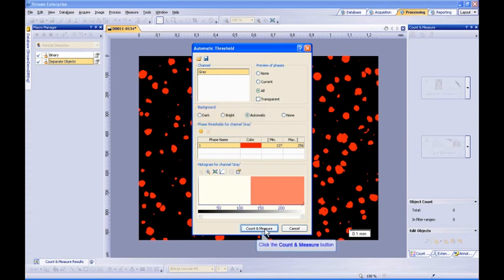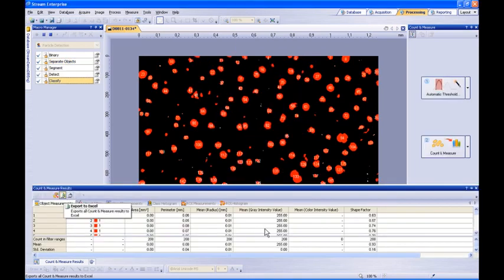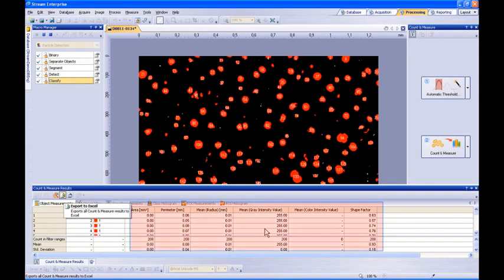After we segment our image or set our thresholds, we can simply press the count and measure button. After clicking the count and measure button, measurement results are listed for each individual particle in compliance with the parameters you had previously defined. For example, area, diameter, or aspect ratio.